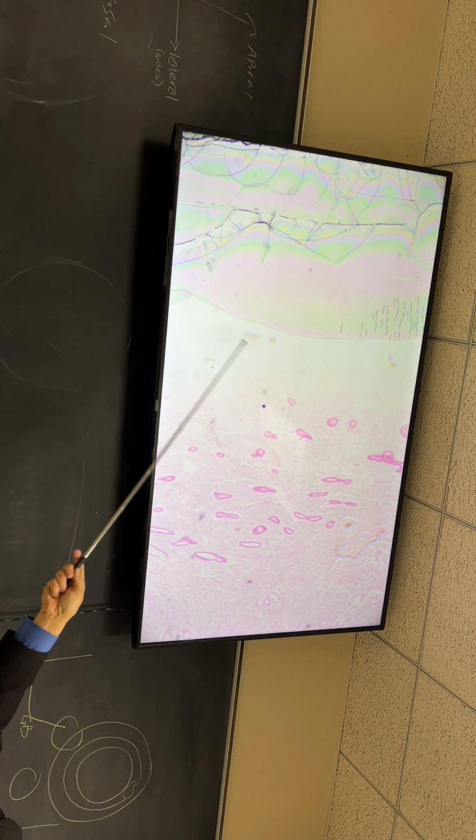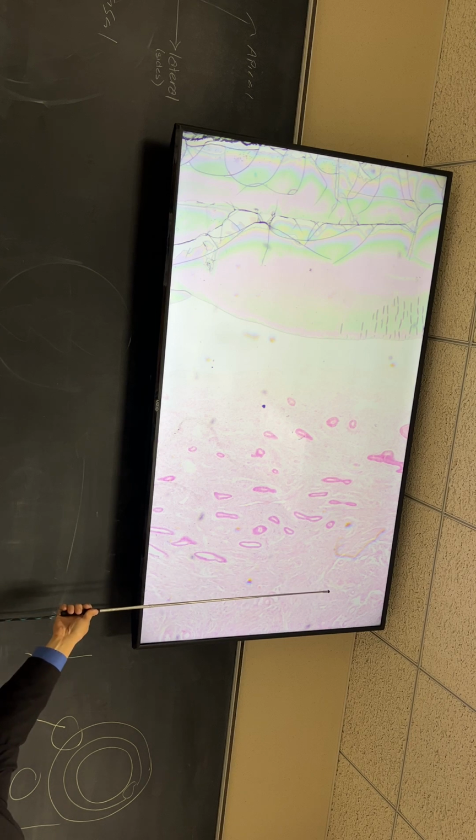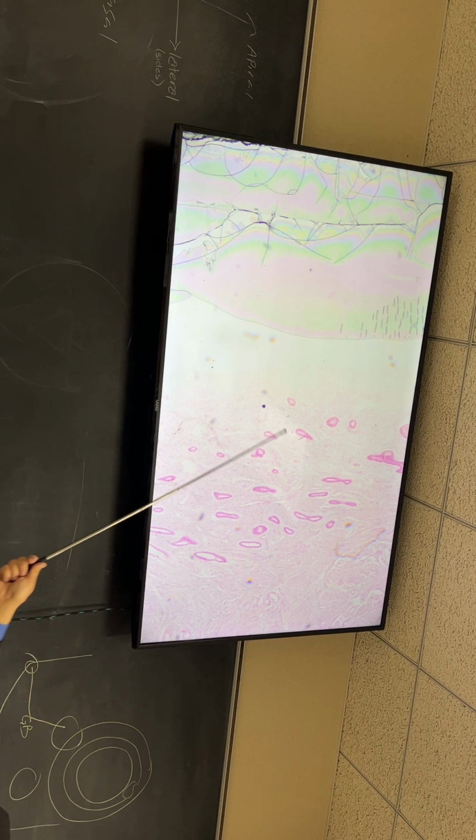This is the inner part of it. Endometrium starts somewhere in here. It's a little gray. I can't see it. Can you see the edge of it? Somewhere around there. I can't really tell where the edge of it is. It's a little light for me. And then it ends right about here, right? That's literally it. That's endometrium.